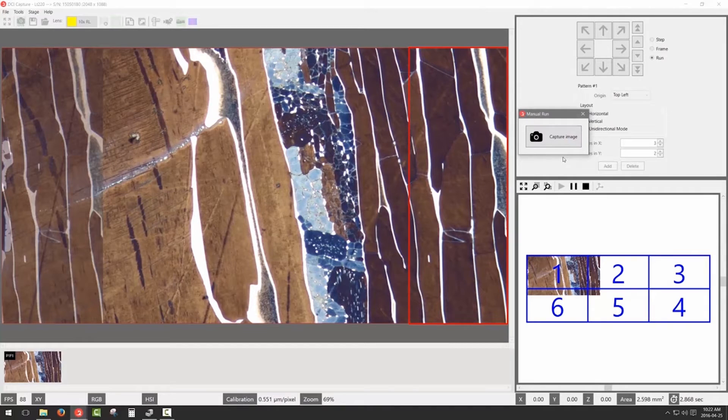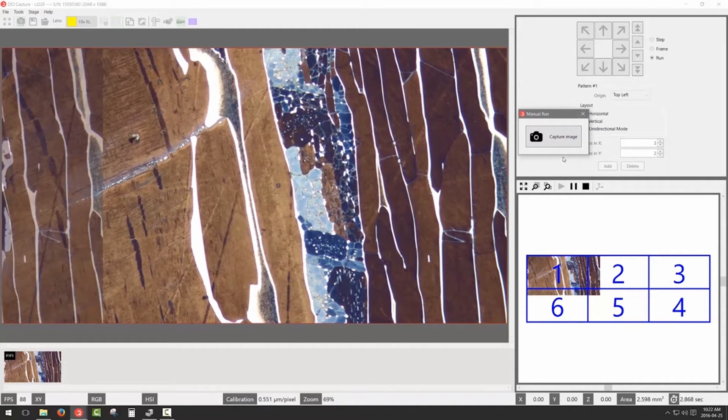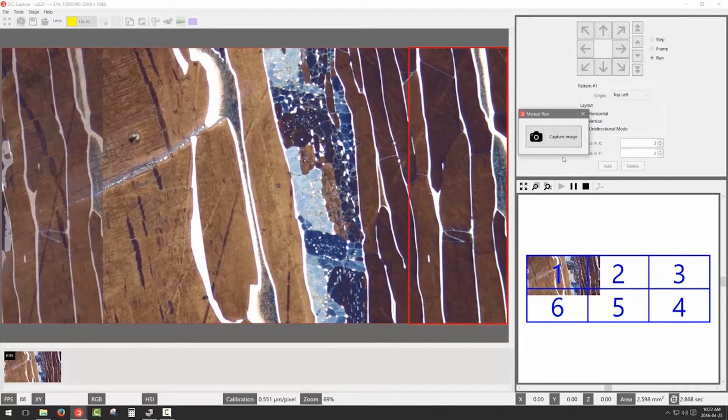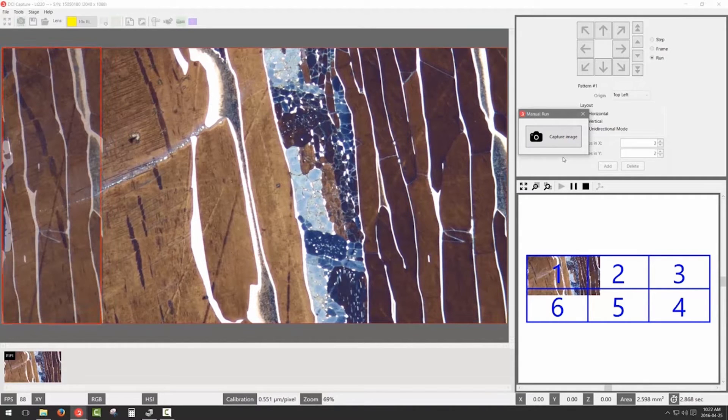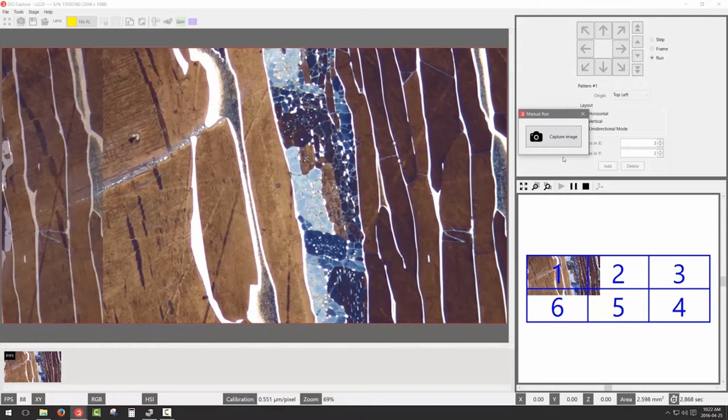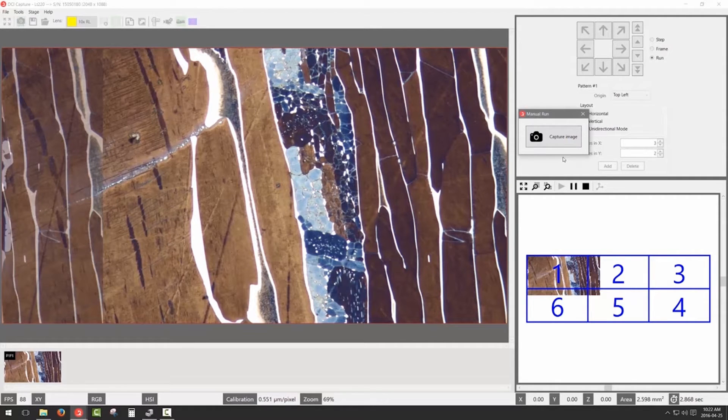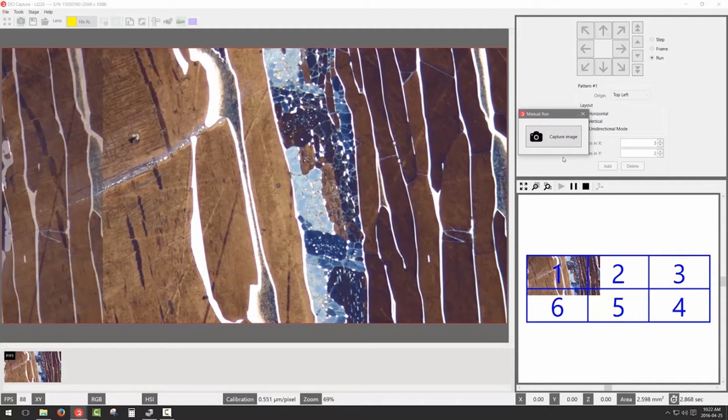To make a good tiling, or mosaic, we want to bring what is in the right red frame section under the overlay. You don't need to be 100% precise. The software stitching function can easily compensate and will give you plenty of room to maneuver.